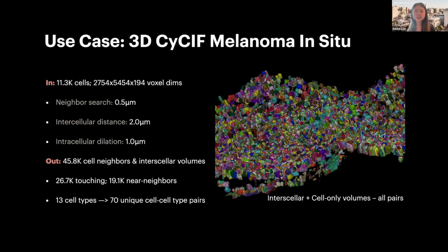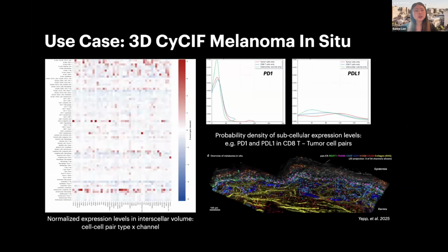And now you have everything segmented out as essentially voxel data frames where you can do feature extraction in order to see what biomarkers are present in that space. As a quick overview of the runtime efficiency of this whole method, I ran this fully locally on my computer with 4 CPU cores parallelized. And this full pipeline for around 10K cells took less than 2 hours to both find the neighbors and also compute all of these volume spaces.